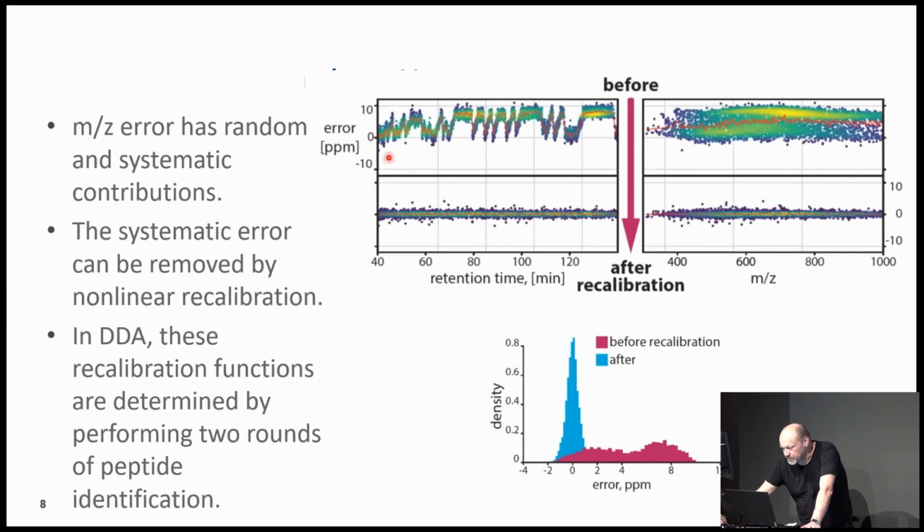So you saw this, maybe you remember this bimodal signal here. So if you plot the mass error in ppm against retention time, you see kind of this flip-flop behavior. I mean, it's a little bit extreme nonlinearity that you have there, but it does exist. So this is a real existing example that we are showing here. And so here you look at the retention time dependence of the mass error in ppm, and here you look at the M/Z dependence of the mass error in ppm. And then we simultaneously fit curves to both of these. Could also be ion mobility, the ion mobility dependence if there is. And then this is subtracted from the data.